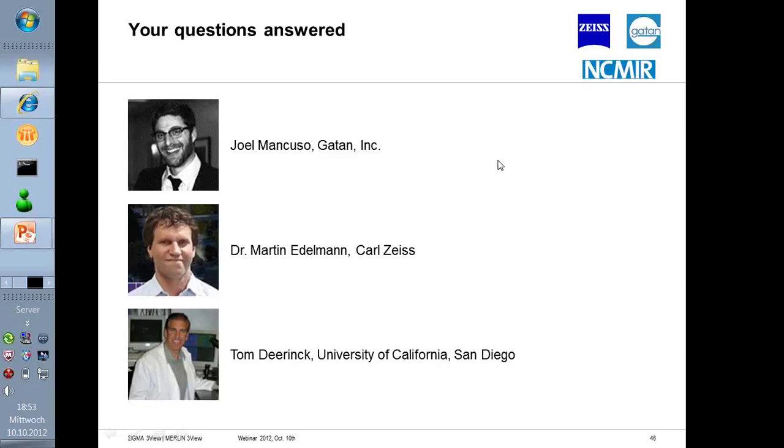Yeah, John, you can go on with the next question. Can traditional immuno-EM be used in 3View? Yeah, so this is a problem. We've been working on trying to improve protein labeling for EM for a long time. This has been a project that we've been working on with Roger Tsien for many years. And you can, but as you're aware, in order to get antibodies in for labeling of tissue, often you have to use very compromised chemical fixation, and you have to use detergents such as Triton or saponin to get your labeling in even just a little way.